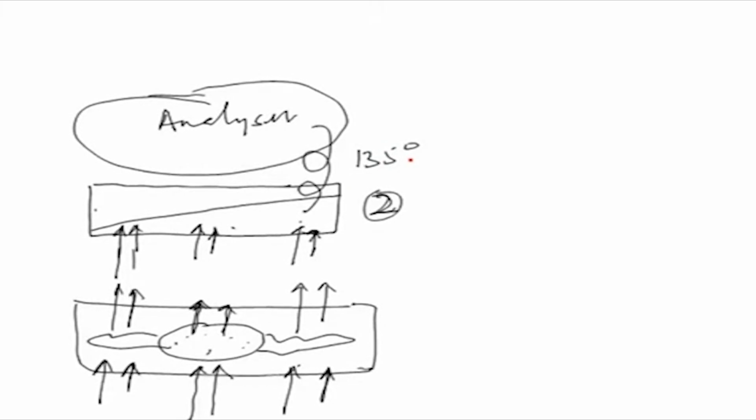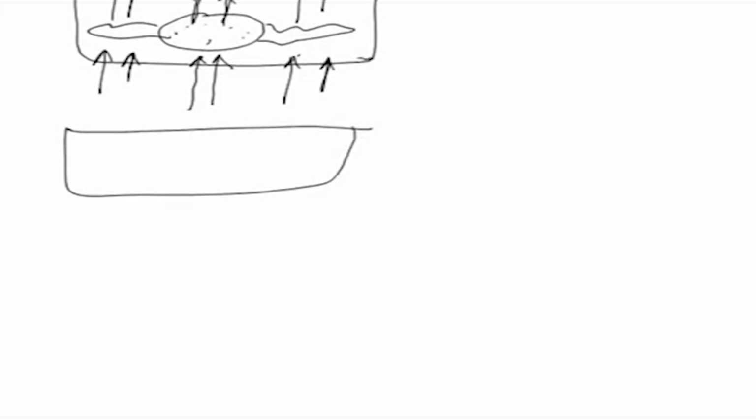So, what is happening? Let us repeat it a little bit to make it clear. Light goes through the first prism, prism number 1, and passes through the specimen. This light was single and now here it is sheared. All the parts of this sheared light pass through the condenser lens and are focused onto the specimen.